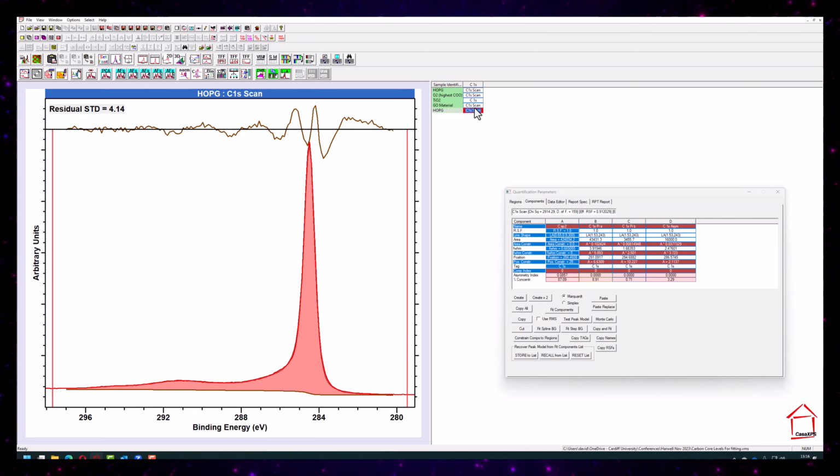So that gives you an idea of how to play around with the LA line shape. You may find you want to experiment with the LF line shape, which basically dampens the tail by adding a fourth parameter to this data.